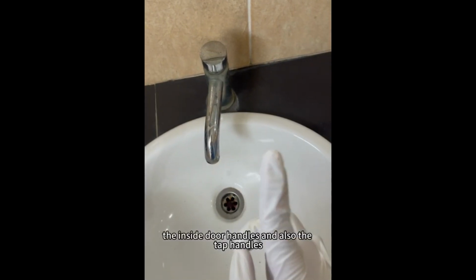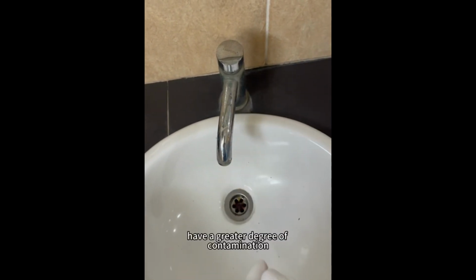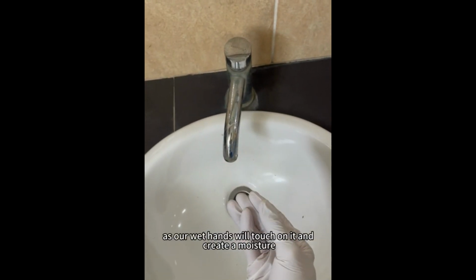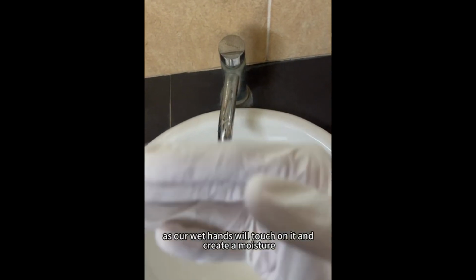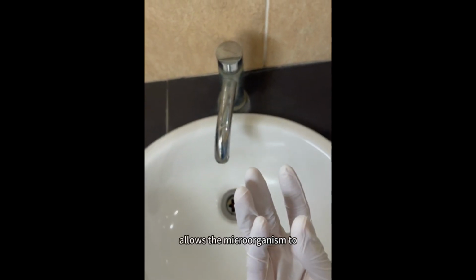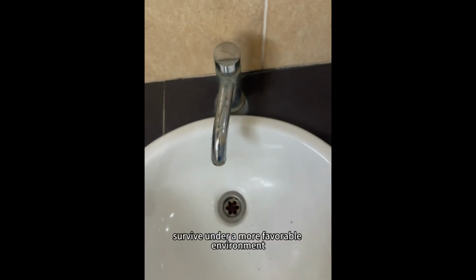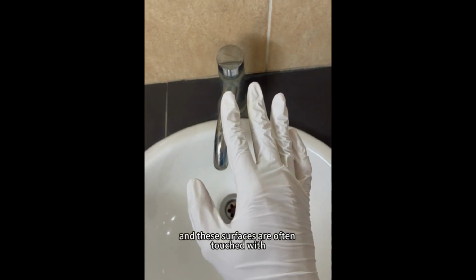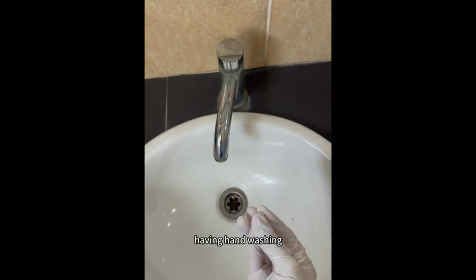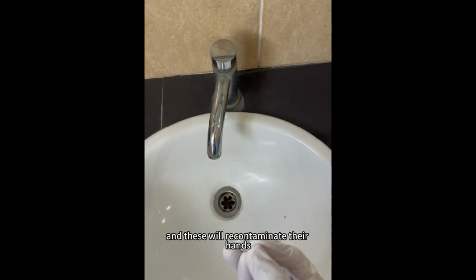The inside door handles and also the tap handles have a greater degree of contamination, as our wet hands will touch them and create moisture on the surfaces, which allows the microorganisms to survive in a more favorable environment. And these surfaces are often touched with wet hands after people have washed their hands, and this will recontaminate their hands.